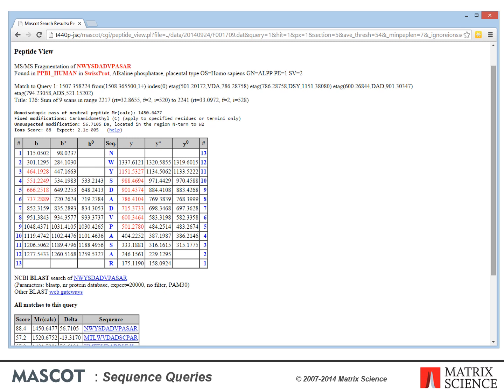This is almost certainly carbamidomethylation, which often derivatizes amino groups. This is why the original database search failed to get a match, and illustrates how the error-tolerant tag can get a match when the modification is unsuspected or even unknown, not in the modification list.